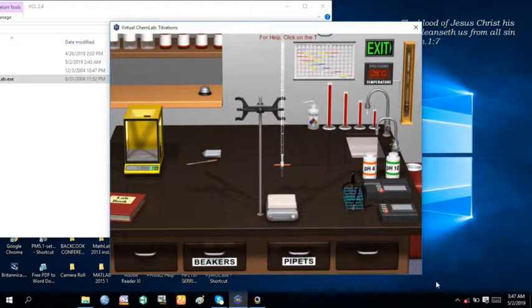The equivalence point of the titration is the point where the analyte has been completely consumed by the titrant. It is identified by the point where the pH changes rapidly over a small volume of titrant delivered.